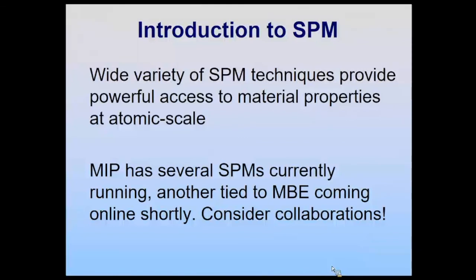So we have a question from North Carolina Central. They have a question of which manufacturer is the AFM system from at Penn State now. So the AFMs that are in the MCL are from Bruker. Yeah, Bruker Icons. So I was typing in the box, those of you online, if you go to mri.psu.edu and you click on the MCL tab, the Materials Characterization Lab, you can find every instrument with all their capabilities, their manufacturer, and so forth, on that site when you start clicking through. And if you go to the AFM tab, there is a long list of properties which I did not take the time of showing, but they're all there. So there's a lot of information to back that up.